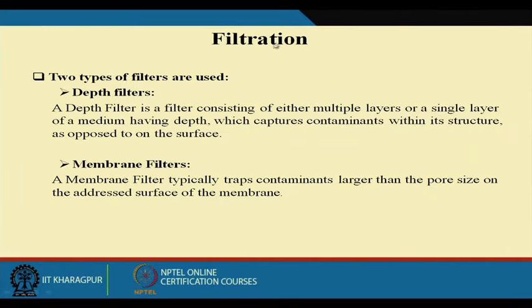Now for filtration, we use two types of filter. One is called the depth filter and the other is the membrane filter. A depth filter is a filter consisting of either multiple layers or a single layer of media having depth, which captures the contaminants within the structure as opposed to on the surface.